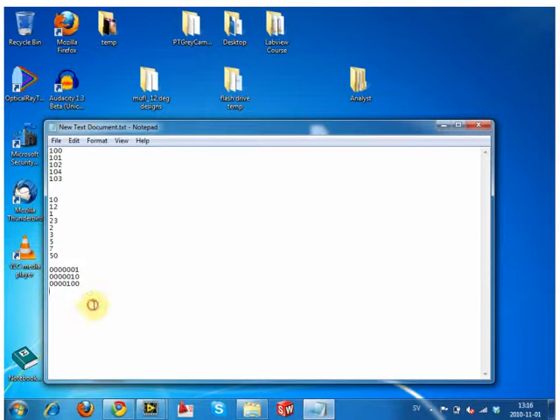you can in fact order them, and in this example you tell it to do a reverse order. It goes along here: all these zeros, okay, this is 1. So I keep doing all the 0 indexes, so those all go first, then the next one is 1. Going left to right, it can always put them in the right order. So this is called zero padding the file name. I have sub VIs that write this, and you can look at it yourself too.